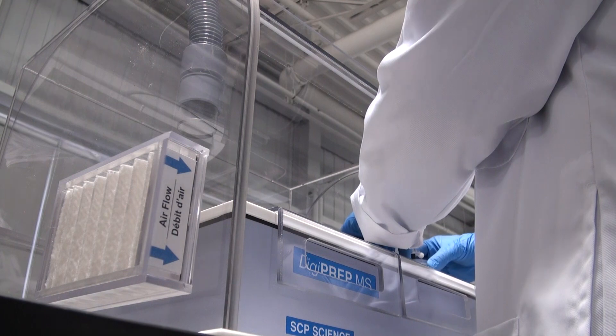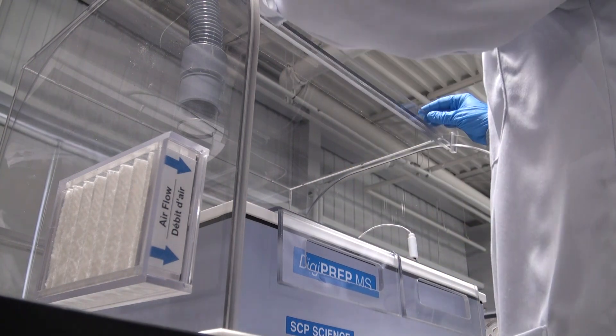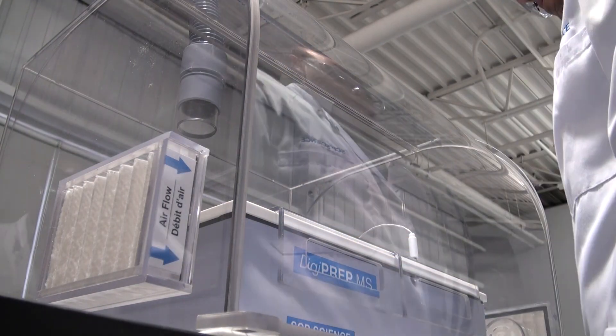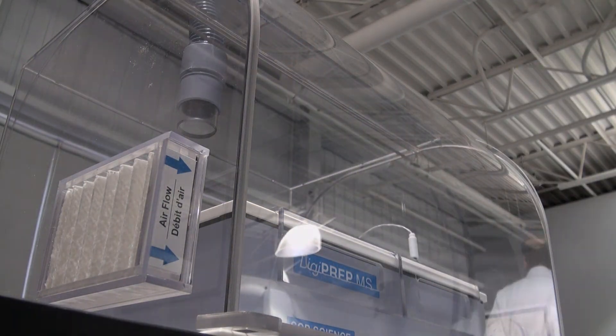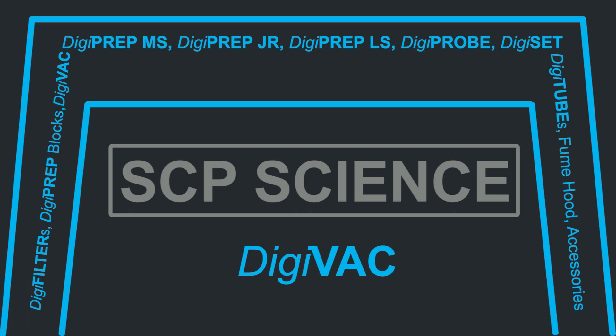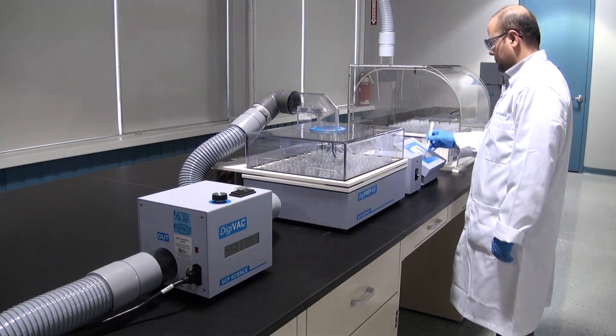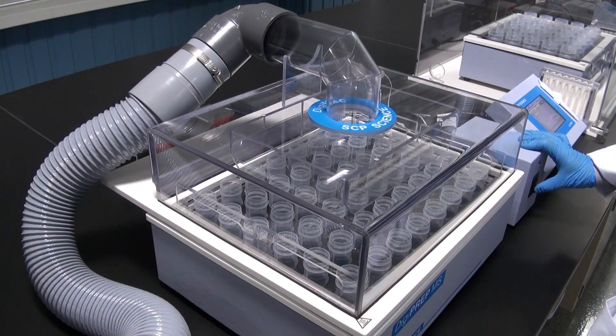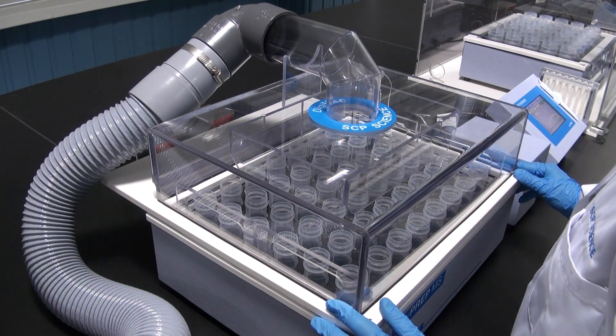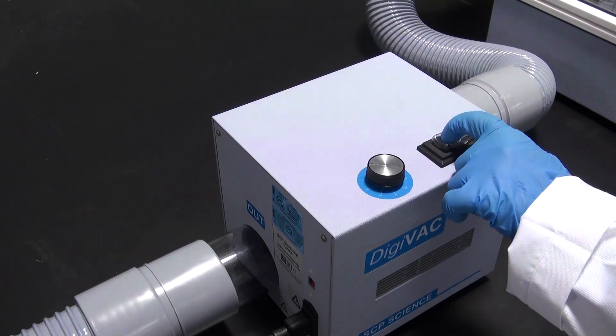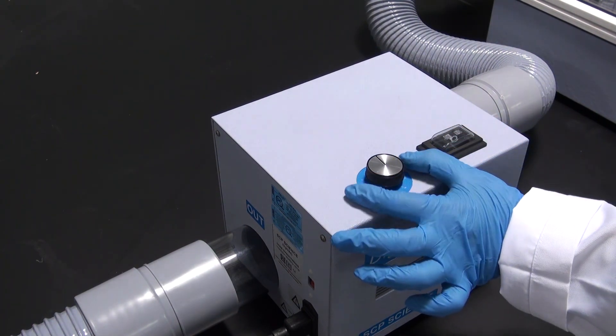Seen here is a Digiprep block for use with 100ml Digitubes. Digivac brings digestions outside of the Fume hood. Digivac helps to provide uniform evaporation rates across all samples, and allows the user to easily observe sample digestions through a transparent collection hood.